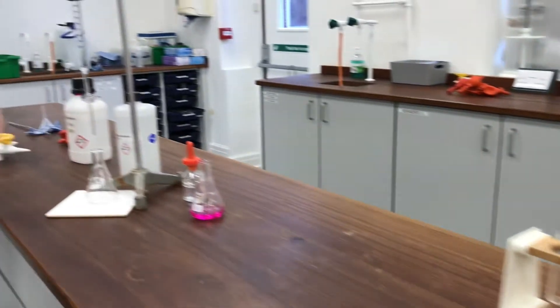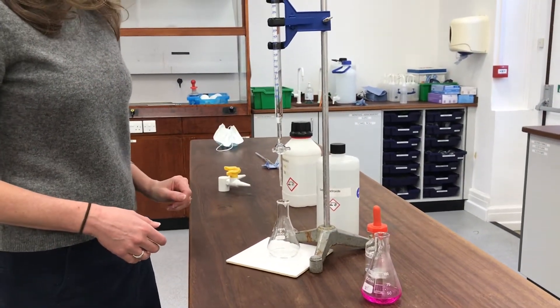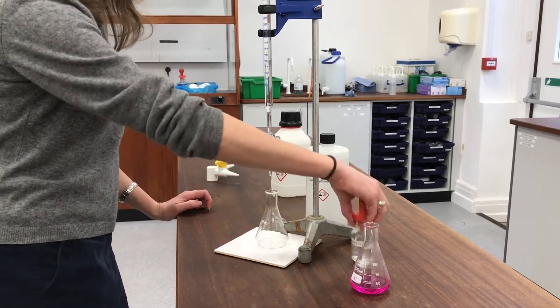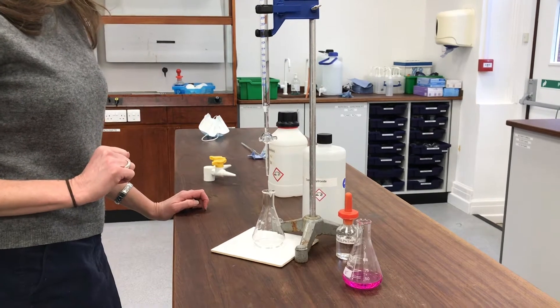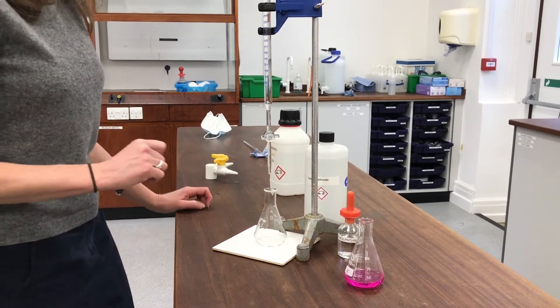I've got one over here that I've prepared - this is 1 mole of sodium hydroxide that I'm using to titrate against my acid. I've got 5 millilitres of hydrochloric acid already in this conical flask and I'm using phenolphthalein as an indicator. I've already done one as a rough titration so I have a pretty good idea of what volume it should take. I'm just doing a second one now to see if I can get concordancy.